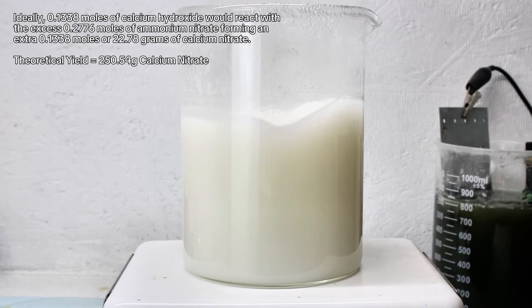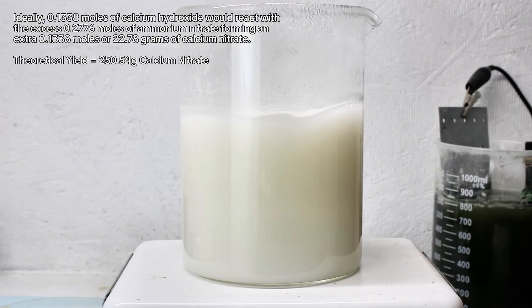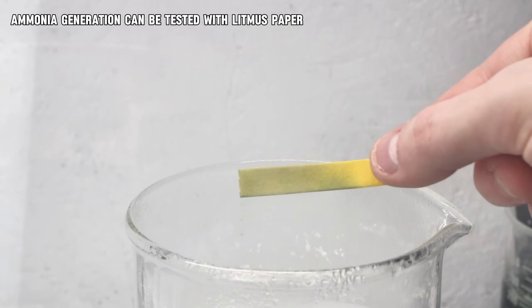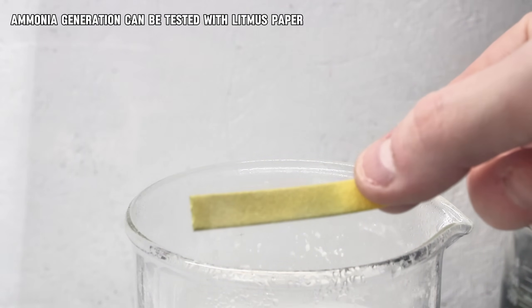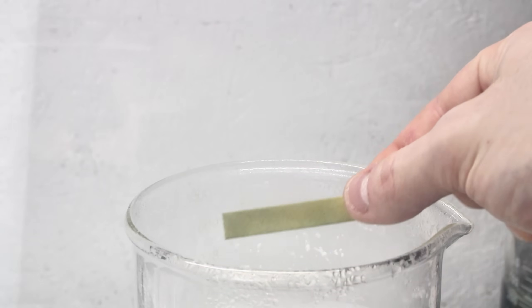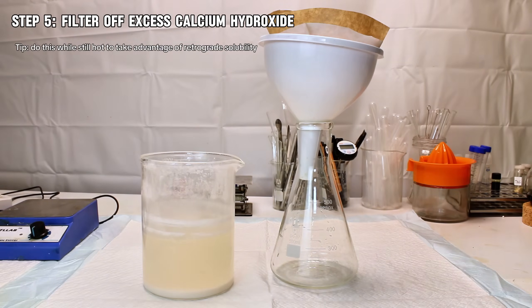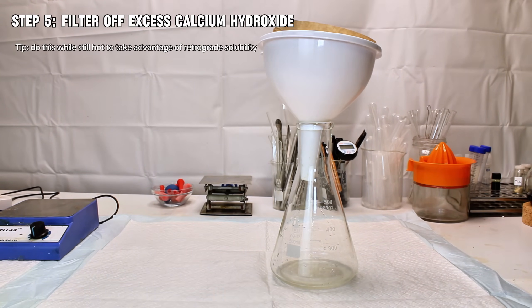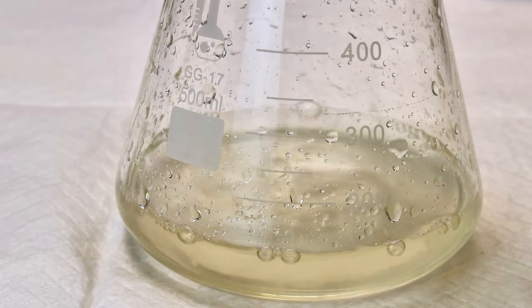I kept boiling the mixture until no more ammonia gas was being generated, which can be tracked by holding litmus paper above the reaction mixture. Ammonia is extremely alkaline and will turn litmus paper blue. Once no more ammonia was being produced, I removed all the excess calcium hydroxide by passing the mixture through a coffee filter.